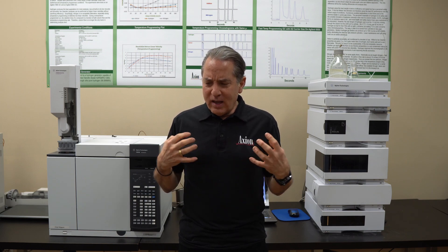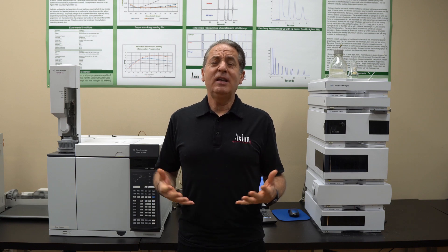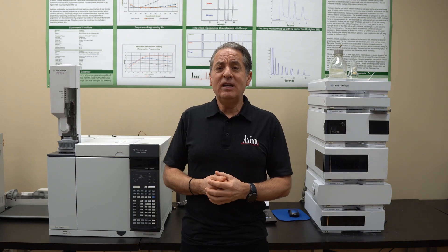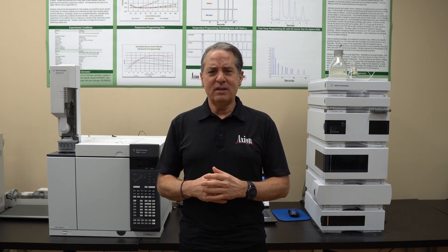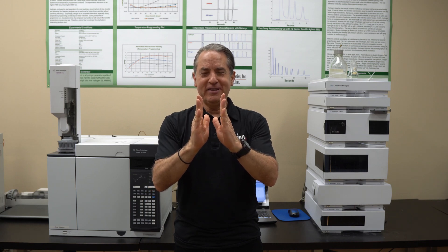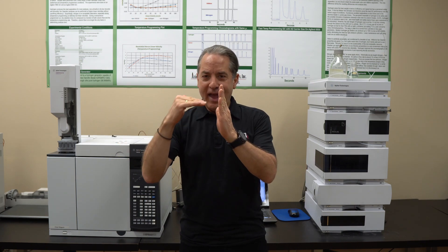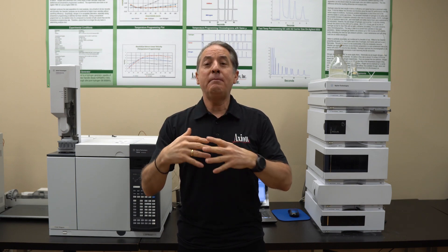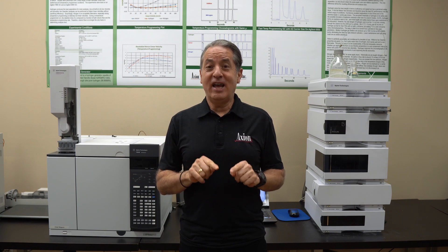So let's say we get this GC, we get the good high purity gases. Electricity — nothing real surprising here. You need a dedicated 20 amp circuit for most GCs. A dedicated 20 amp means the plug sort of looks like this instead of like this, if that makes sense to you. So it's a regular wall outlet but it has that side piece in it. That means electricians know that when you plug that in, that is a dedicated 20 amp circuit.